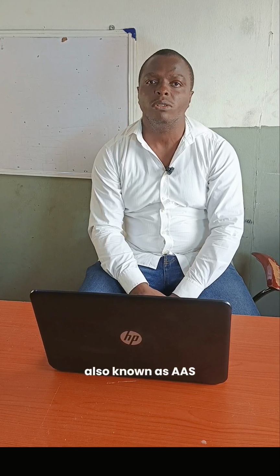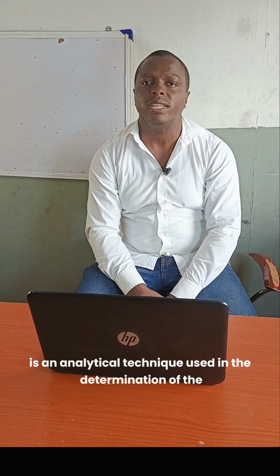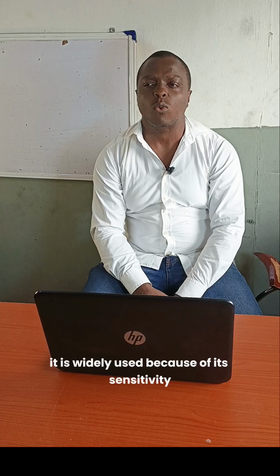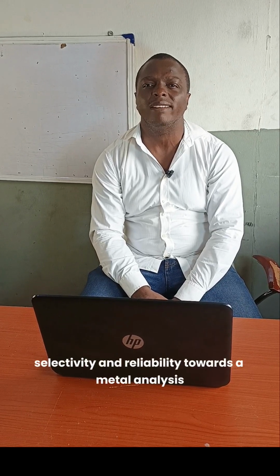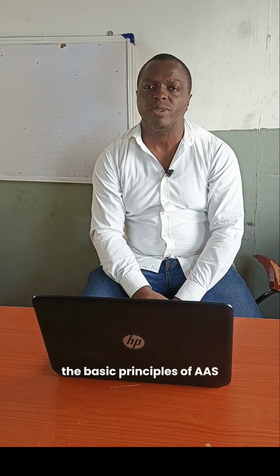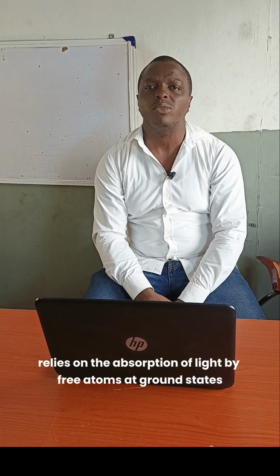Atomic absorption spectrophotometry, also known as AAS, is an analytical technique used in the determination of the concentration of different elements in different samples. It is widely used because of its sensitivity, selectivity, and reliability towards metal analysis.